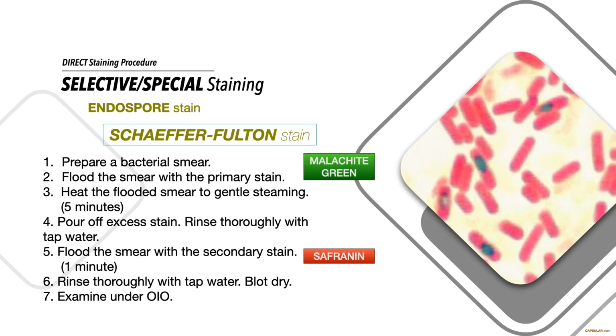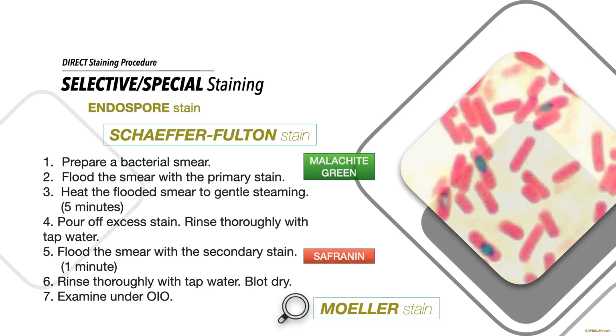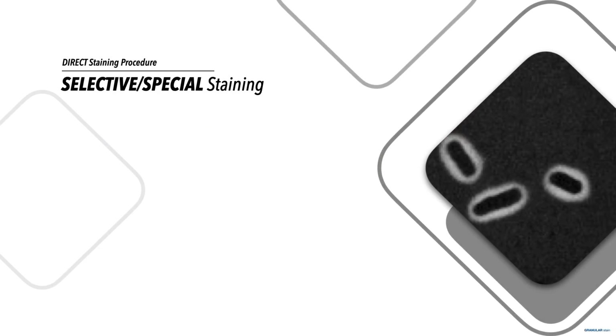Apart from the Schaefer-Fulton stain, we also have another stain for endospore, and I want you to read on that, guys. We have the Moeller stain. But the one usually used for endospore is your Schaefer-Fulton. Remember this.